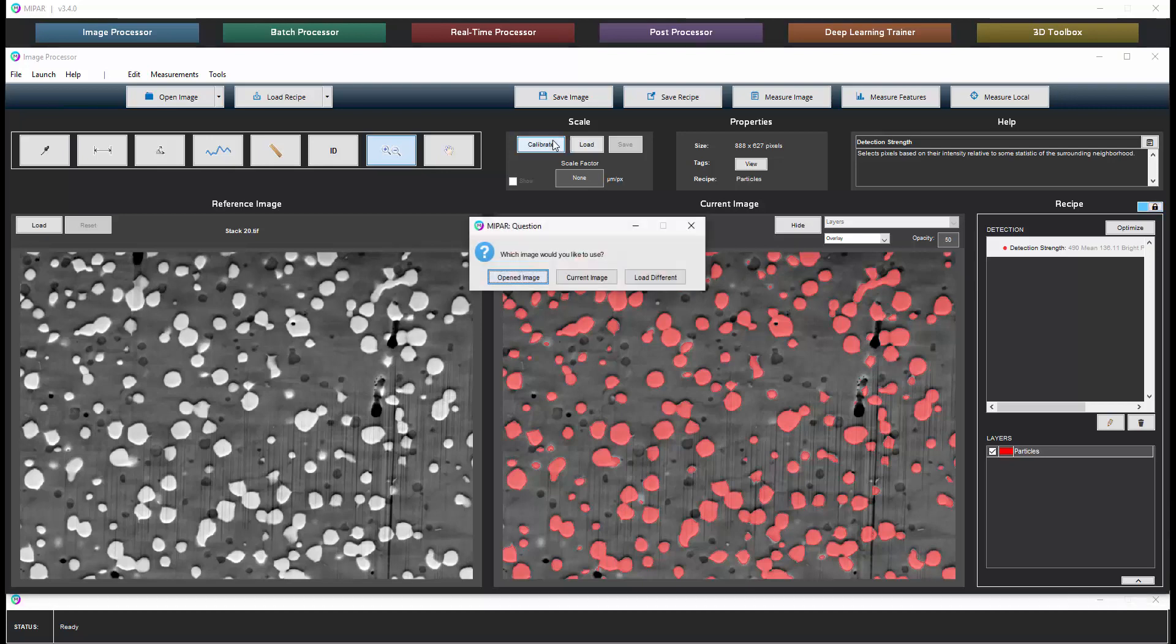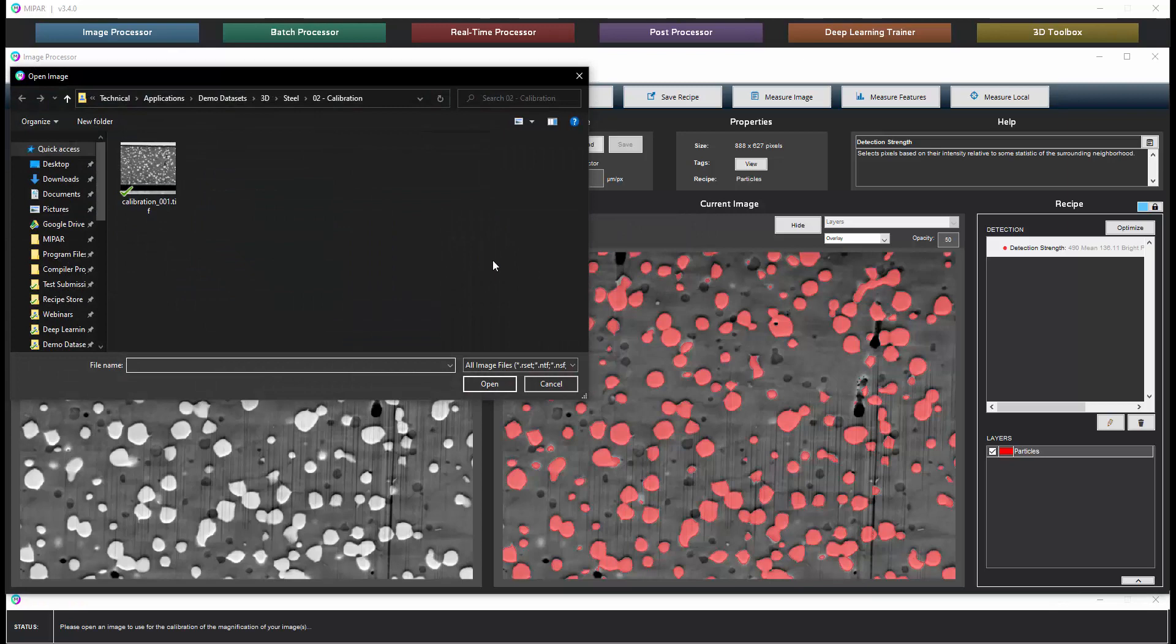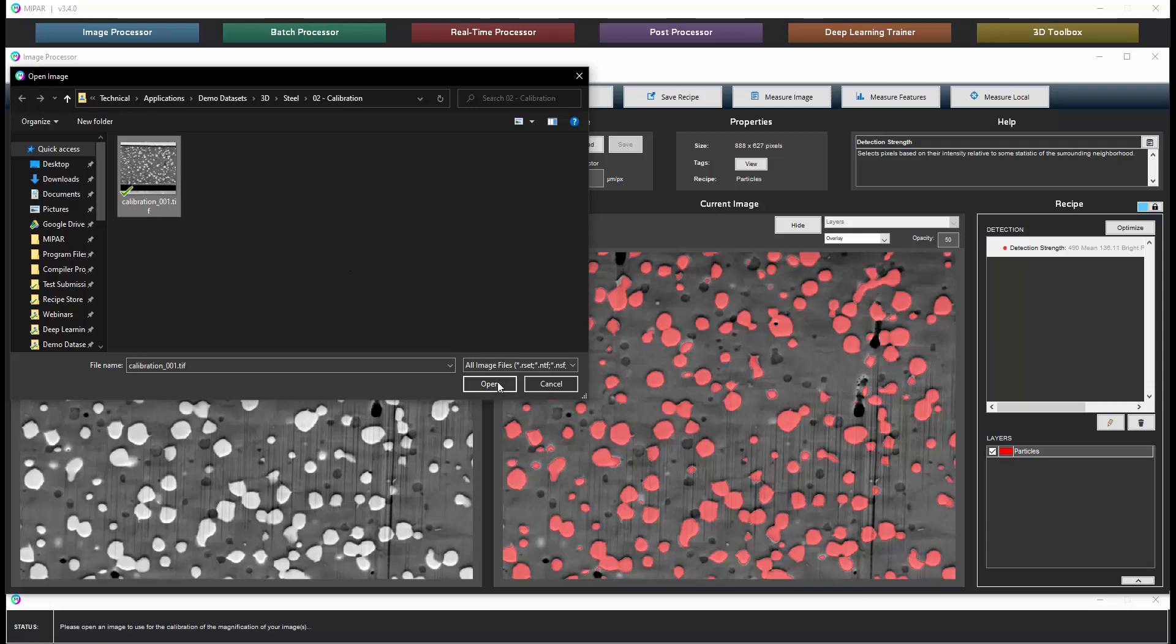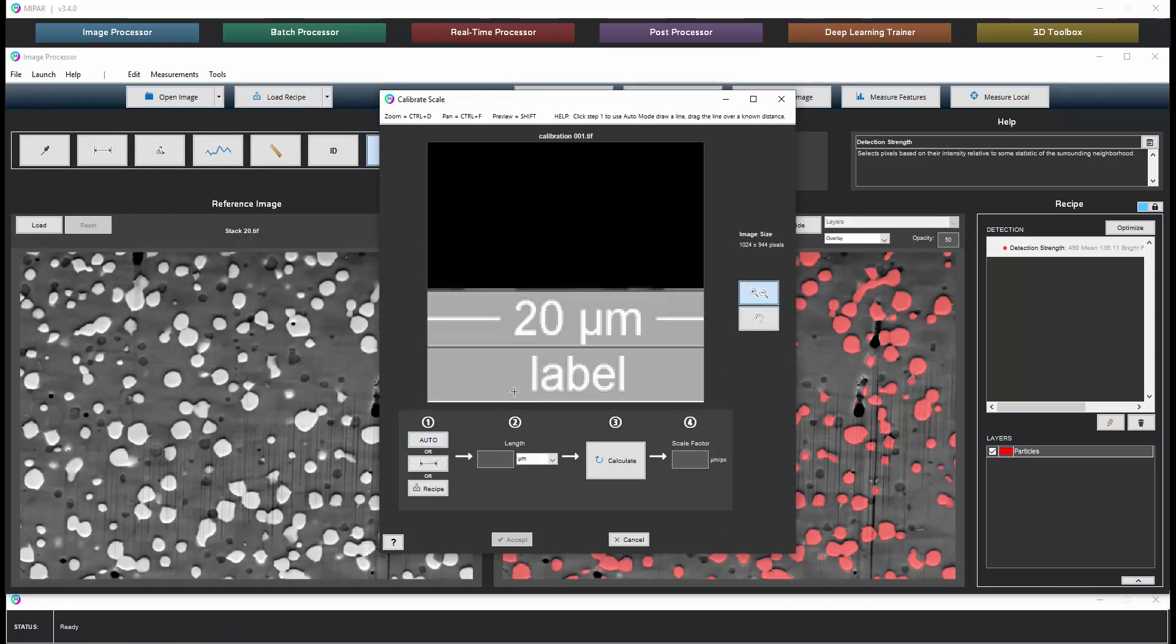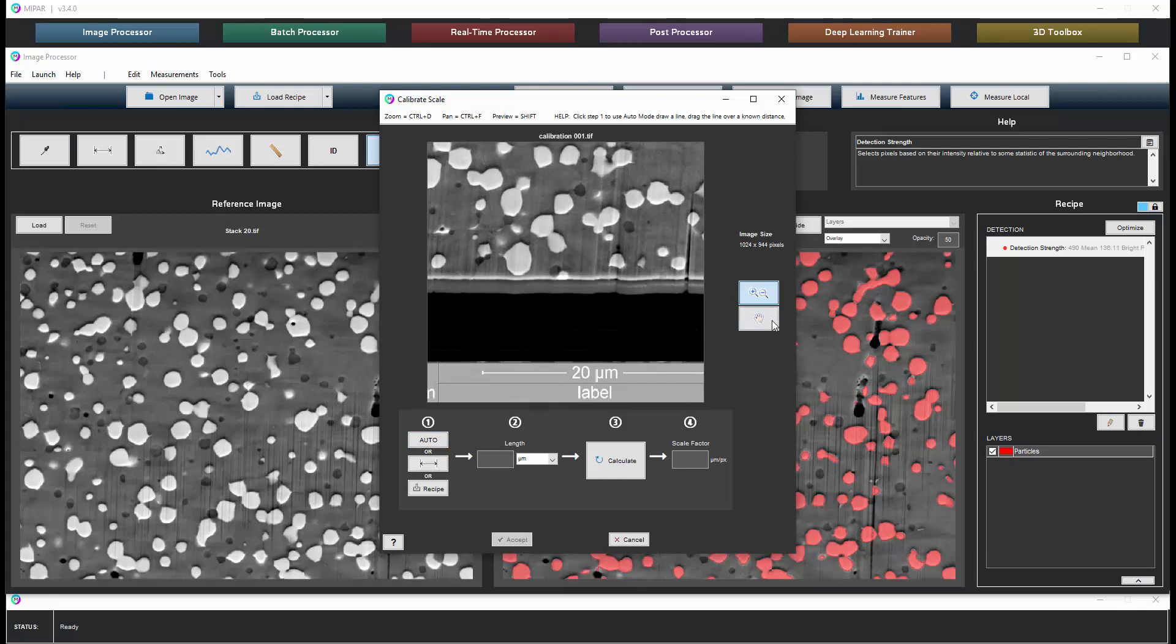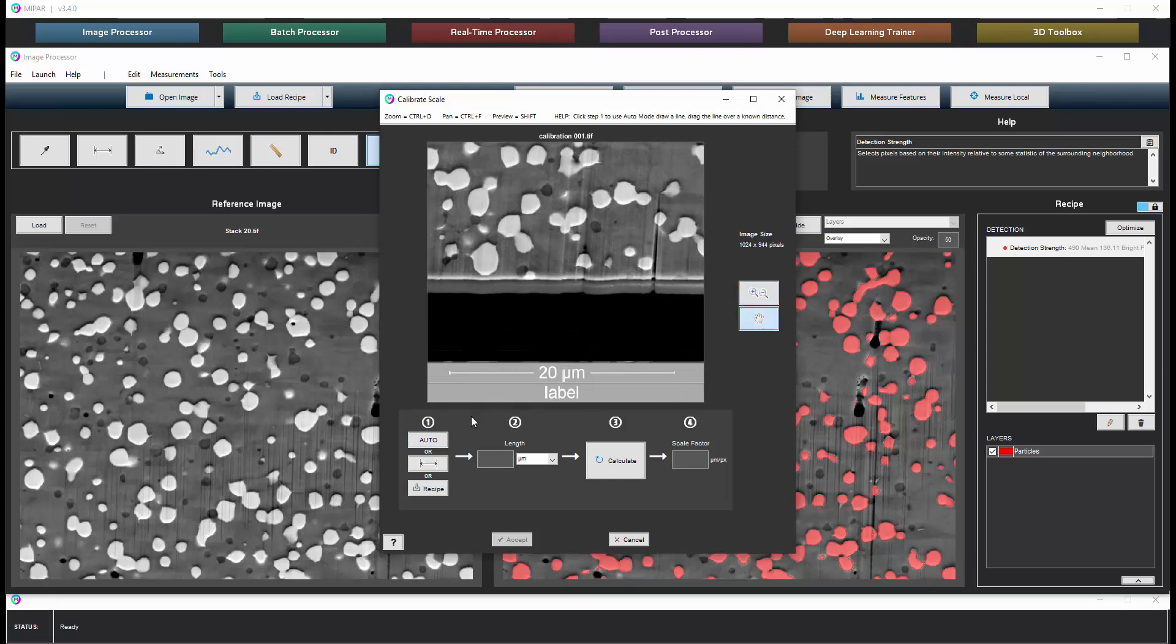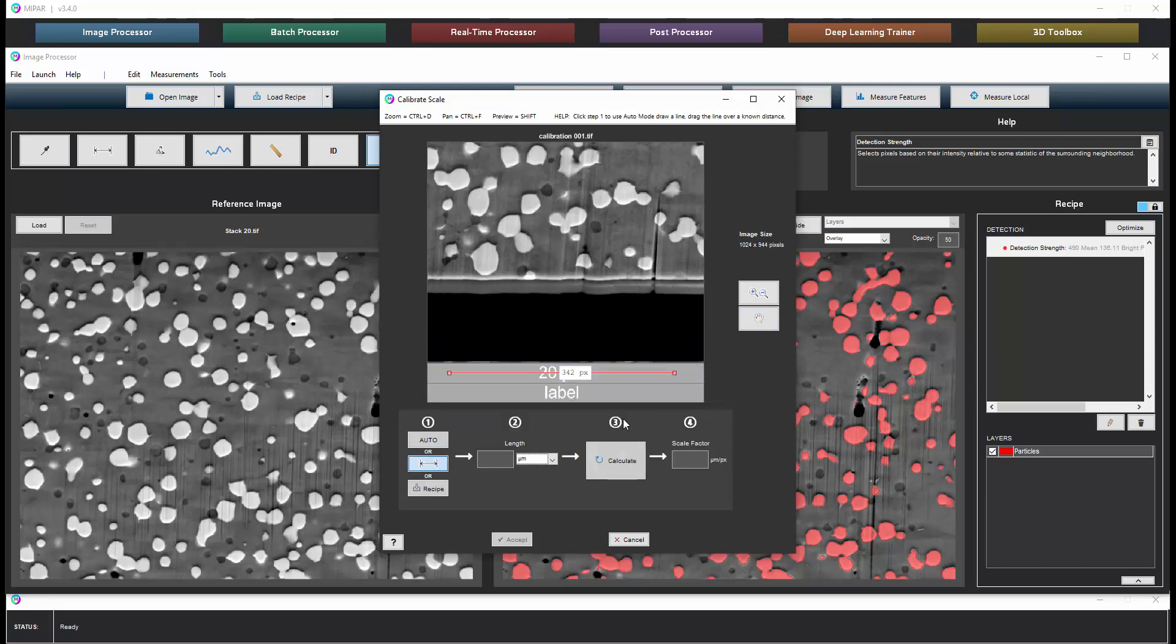So I'm going to click calibrate, choose load different because this particular slice doesn't have a scale bar. I'm going to choose one that does. And we can use the auto function to automatically find the scale bar so that we can set the scale factor. So it finds the bar, we tell it this is 20 microns. Now we have our X, Y scale factor.